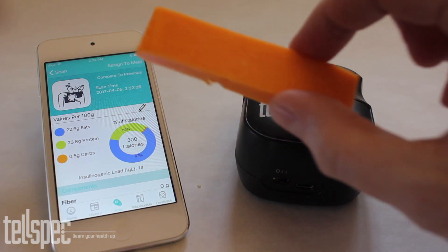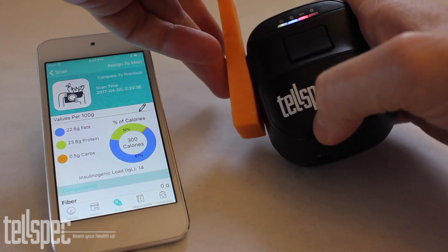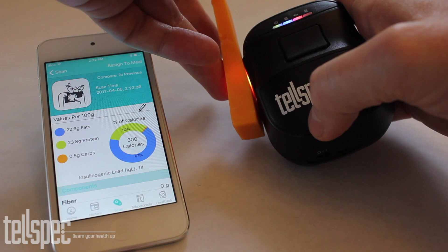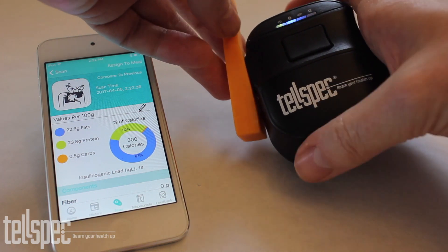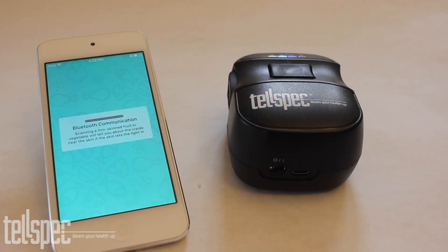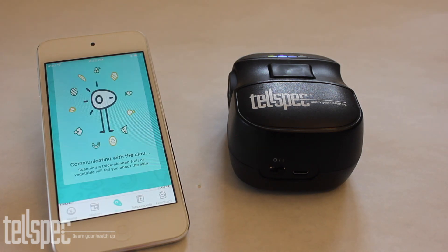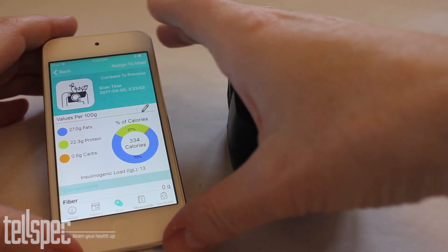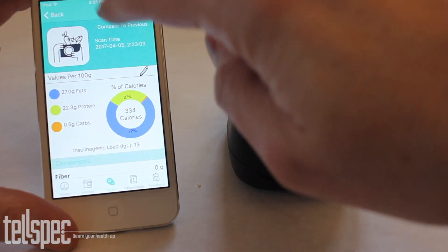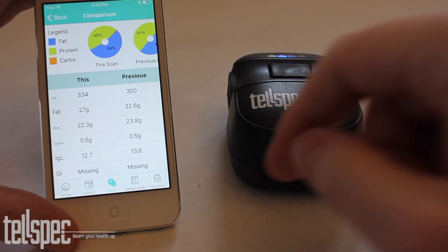Now we'll repeat the process using the cheddar cheese. We scan the cheddar and let the scanner do the scan. When the scan is complete the information goes across to the phone, from the phone to the cloud where it is analysed, and the result is sent back to the phone. Now we can do our comparison, and the user can tell the difference between the two samples.